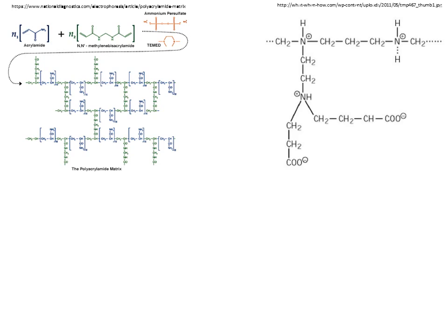We discussed in a previous video how acrylamide is polymerized into a polyacrylamide gel. IPG strips are made in the same way, using a low percentage of acrylamide so that protein size doesn't have a great effect on protein movement in the gel. The pH gradient is made possible by incorporating acrylamide derivatives whose side chains have a certain pH.